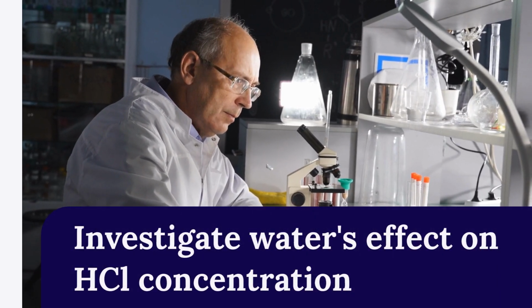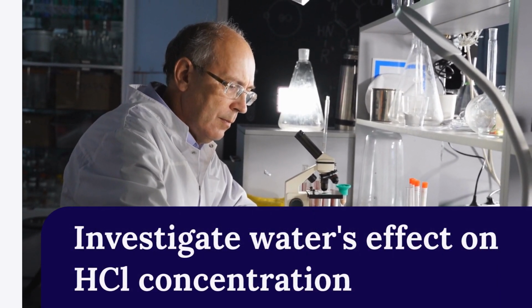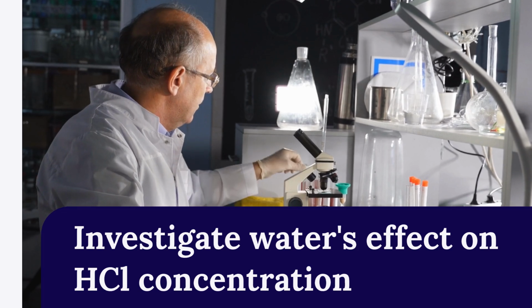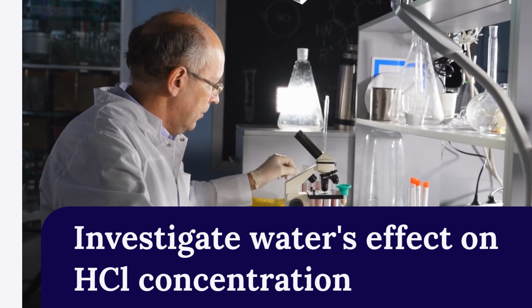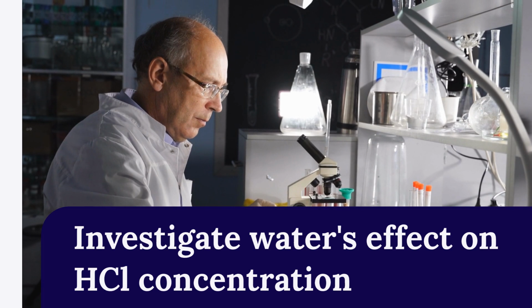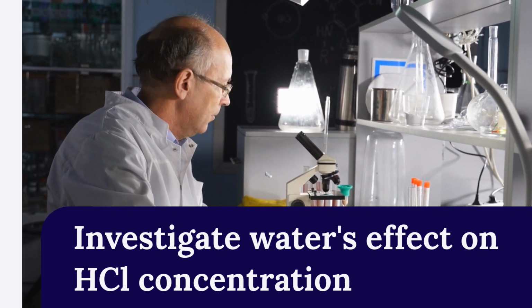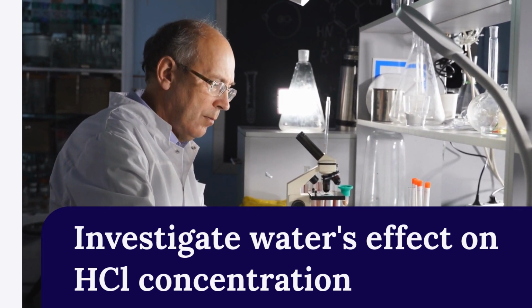Investigate how adding water affects a 1 molar hydrochloric acid solution. Use titration techniques and molar calculations. Focus on changes in concentration after dilution. This experiment addresses key assessment criteria. Prepare to explore the effects of dilution.